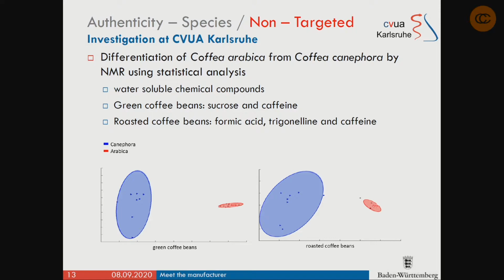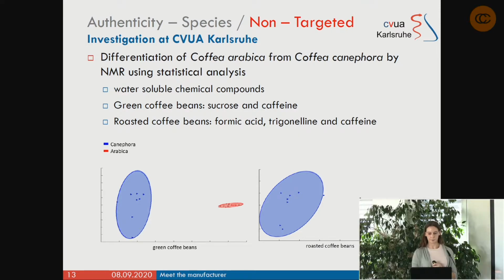were similar, which results in a similar chemical fingerprint. And so the Arabica coffee beans are close together within one cloud. The same applies to the Canephora coffee, but maybe the coffees have been roasted with different roasting profiles or have been treated differently after harvest, and this is reflected in a slightly different fingerprint, which explains the scattering here.